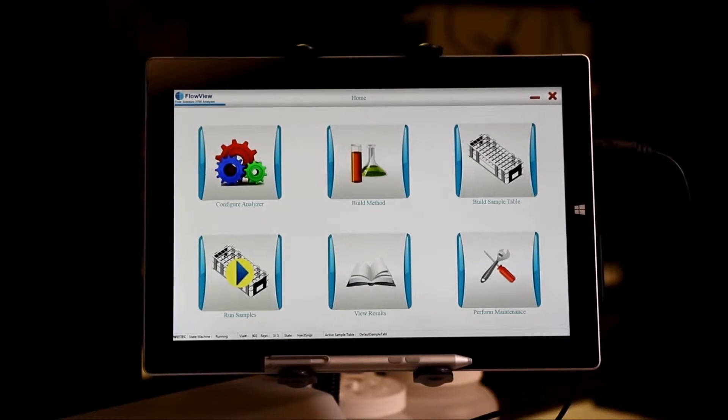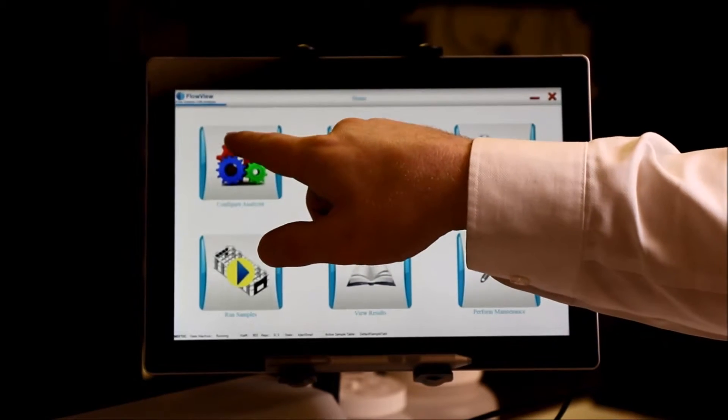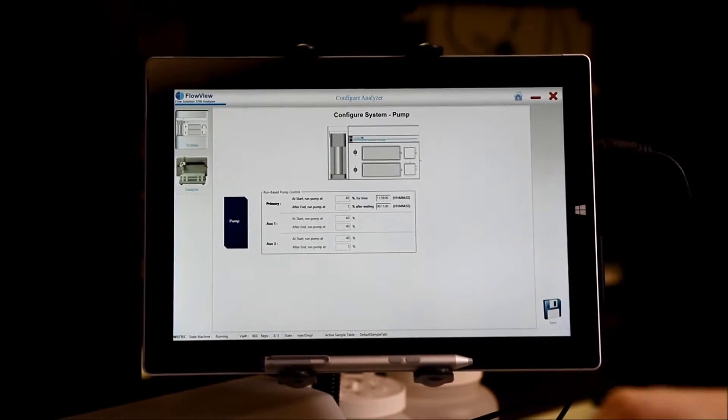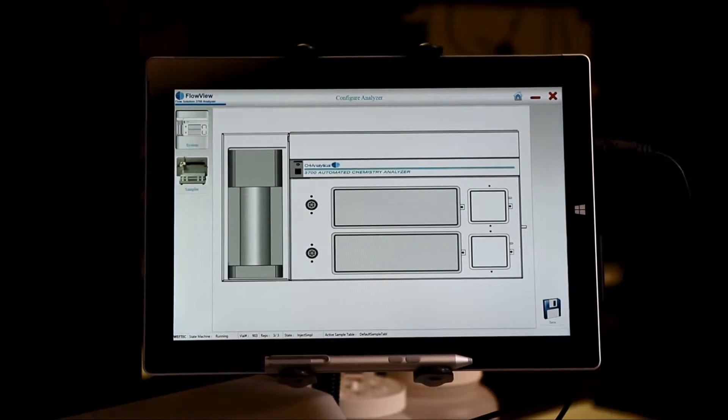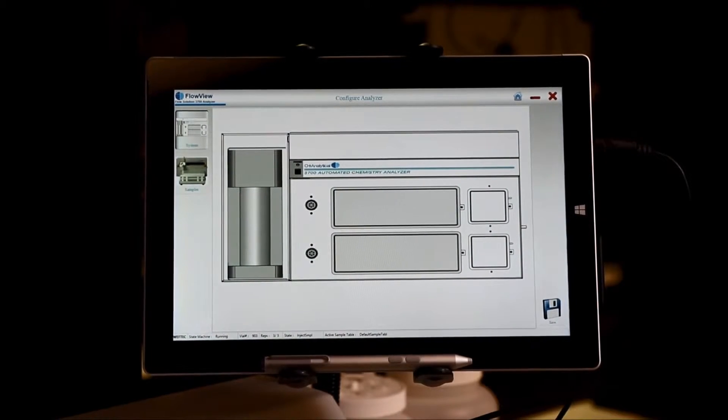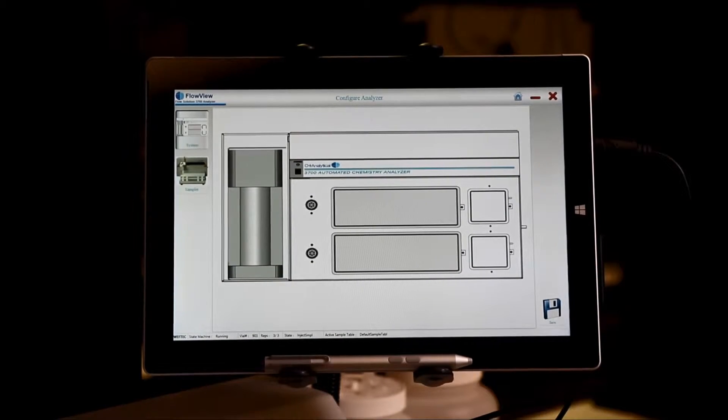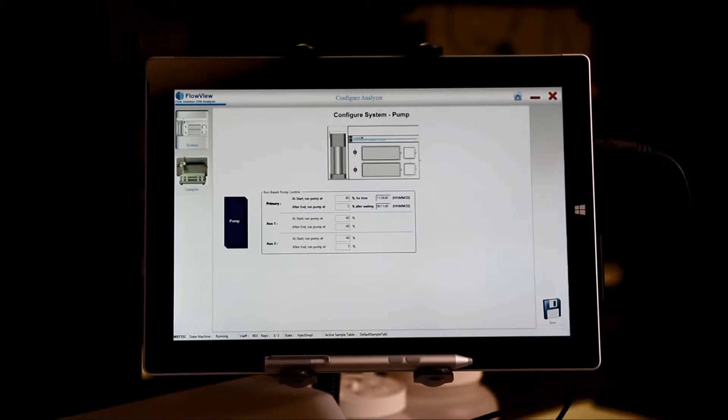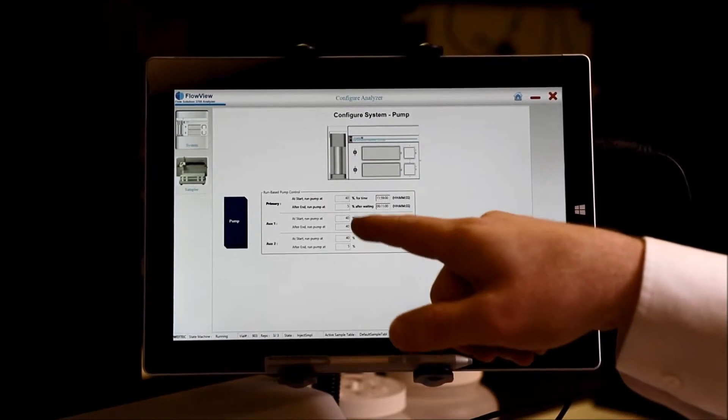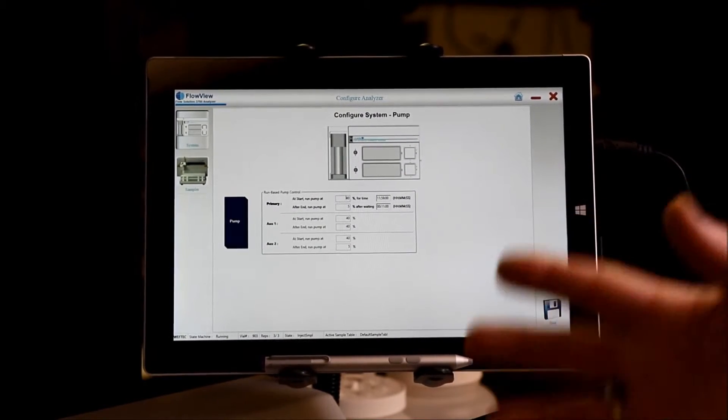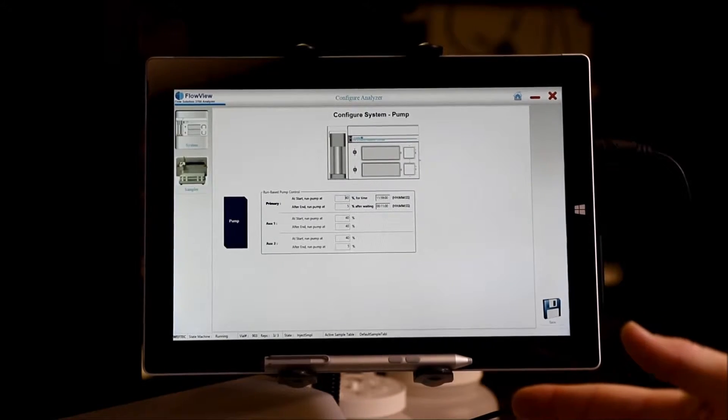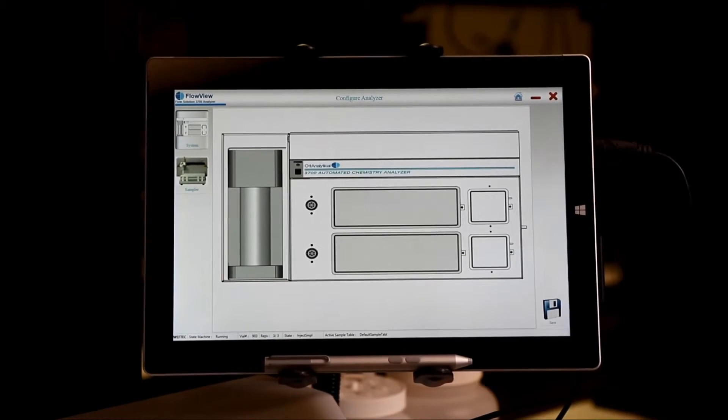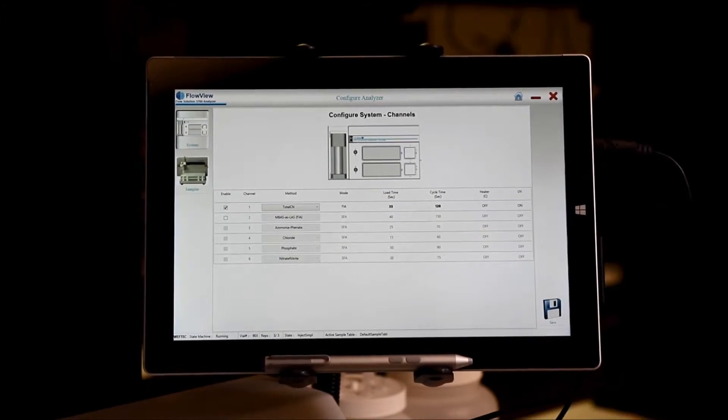From the home screen you can then load the method that you've created into Configure Analyzer. Again, this is a WYSIWYG interface or what you see is what you get. So, in order to change the pump settings, you would click on the pump and set the pump speed to whatever value you care it to be. If you need to change what methods will be run, simply select the channel area.